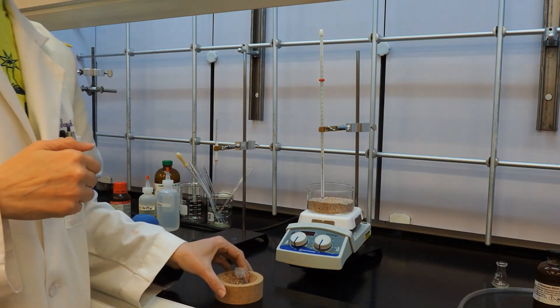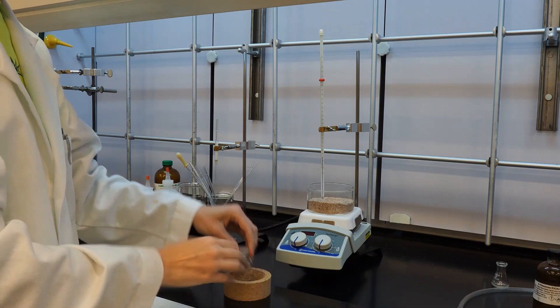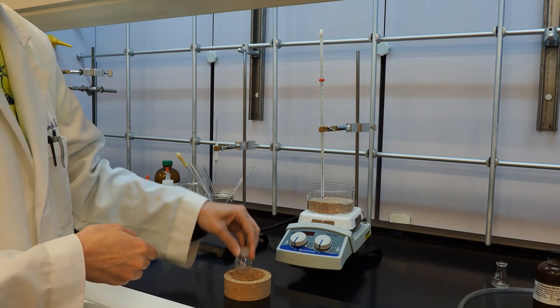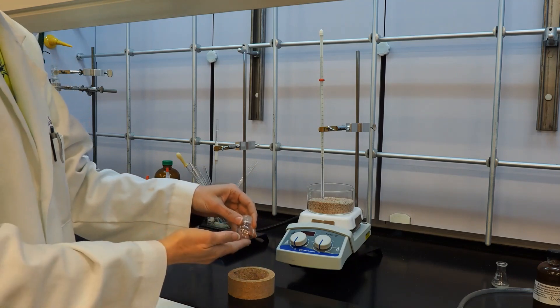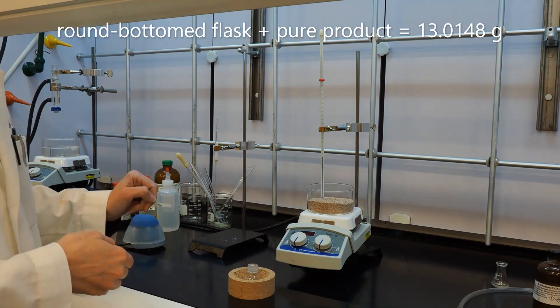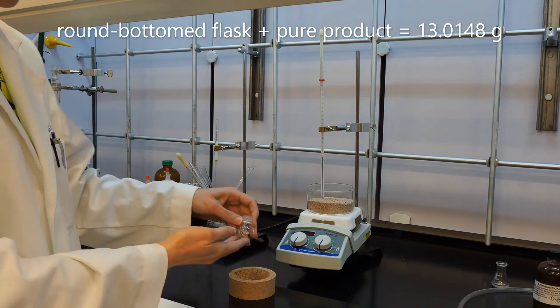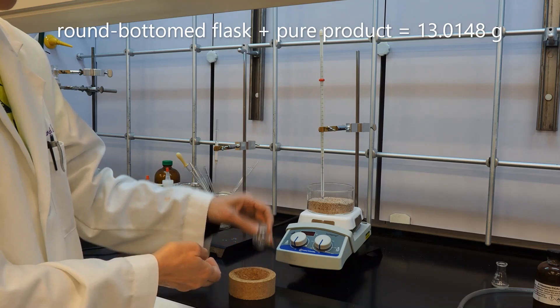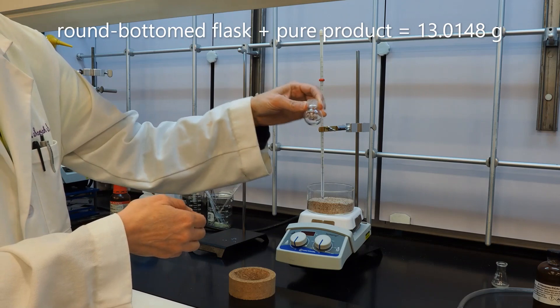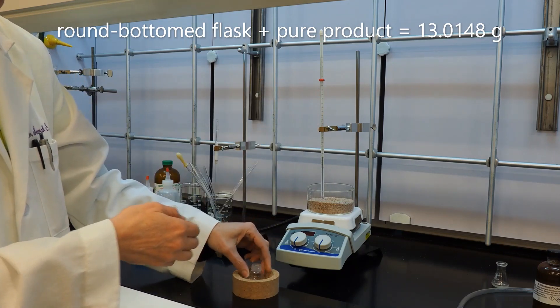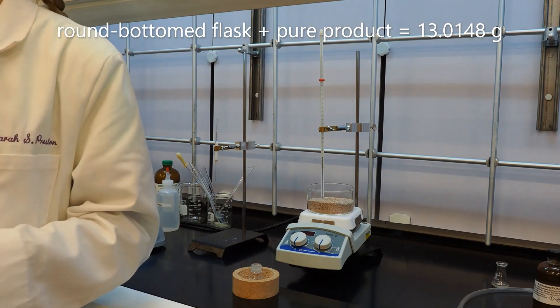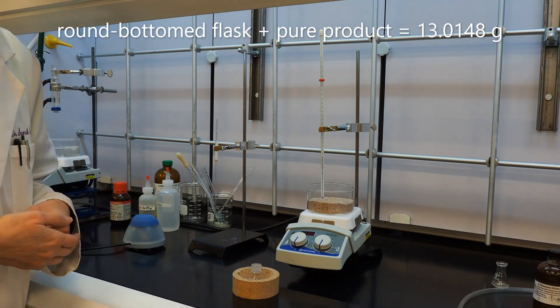So I decided not to rotavap because I had a sand bath here. And off camera I boiled this down to just the product using the sand bath and the nitrogen just like we did before with the ether. And I weighed this flask plus our colorless liquid product, which there is a couple drops in there of it. And the flask plus the purified product weighs 13.0148 grams.